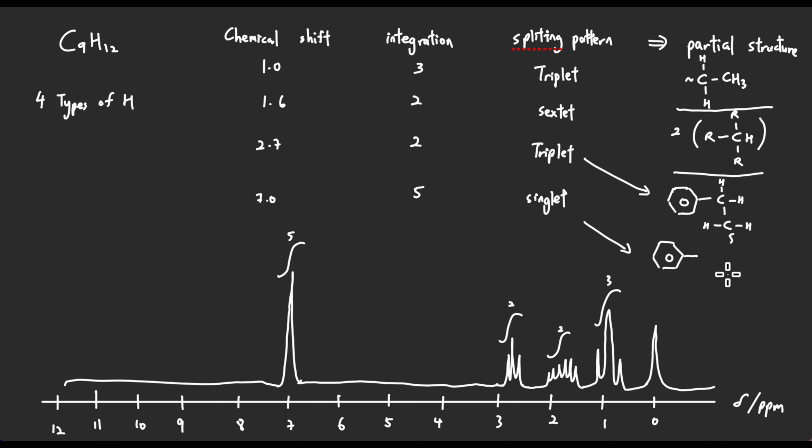Now we're trying to solve the whole puzzle because it's R and it's similar to this one, right? So it could connect with this one, CH2, this, and then we look at this one. The other end would be CH3, right? Now how many carbons have we used up? 1, 2, 3, 4, 5, 6, 7, 8. We only have one more carbon to insert, and the total number of hydrogen would be 1, 2, 3, 4, 5, 6, 7, 8, 9, 10, 11, 12. It also matches our molecular formula. And we have 4 types of hydrogen as well. One is this one, 2, 3, and 4.